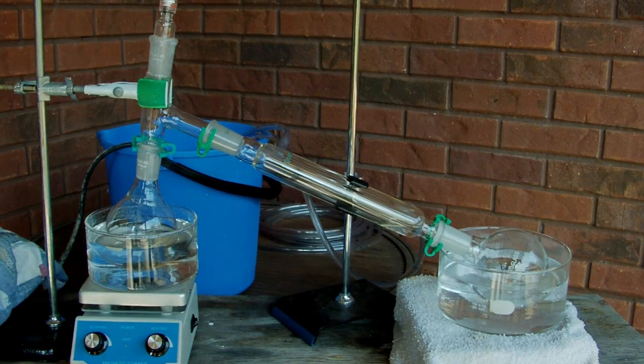Hey, everyone. This video is going to be the first in a small series of videos on how to purify over-the-counter reagents, things that you can buy at hardware stores or drug stores or wherever you happen to get your chemicals. The first thing I'm going to show you is simple distillation, and that's a way to purify liquids. To do that, I'm going to be distilling acetone.